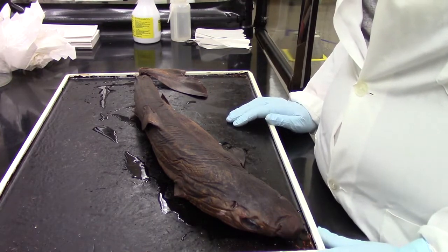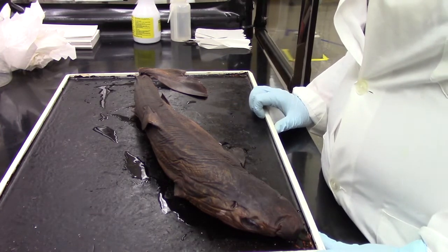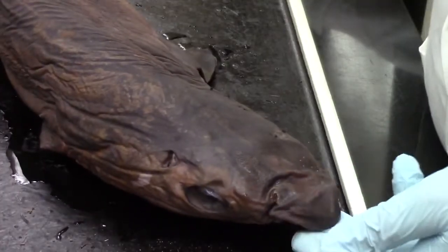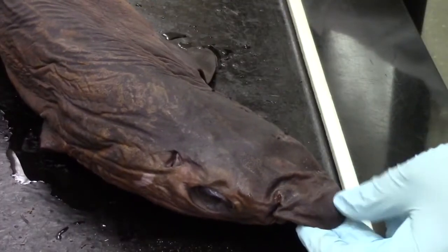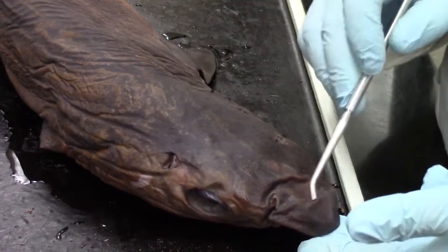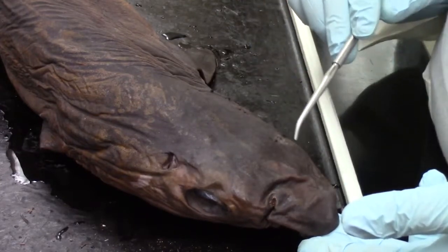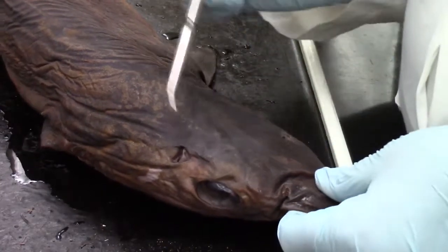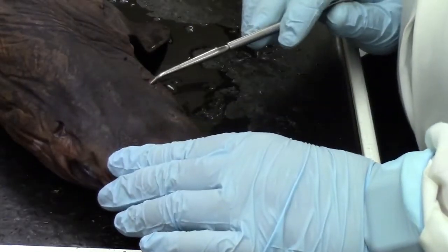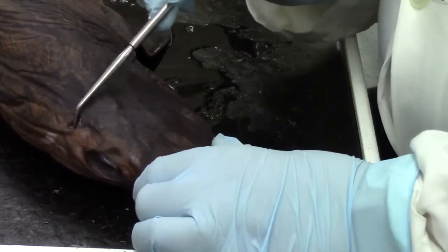Now that we have the broad overview, let's zoom in and look a little closer at some of the zones. All right, if we start at the frontmost portion here, this is the rostrum. Sometimes we refer to it as a snout, but the proper term for this is the rostrum. We can also see the eyes here. If we look just behind the eye here, we can see the animal's spiracle. You can see it on that side there.